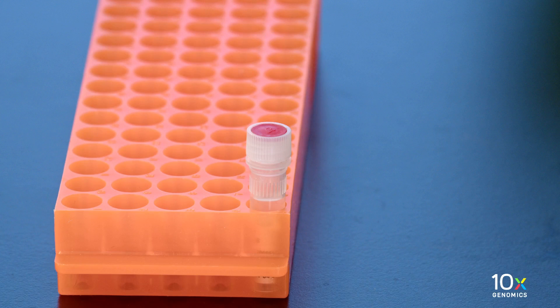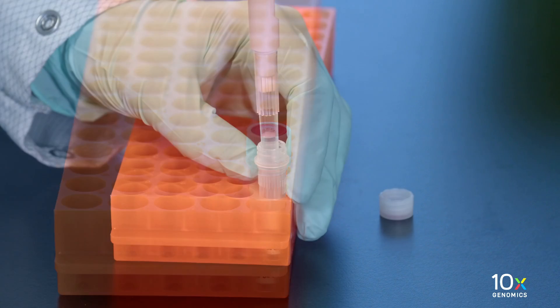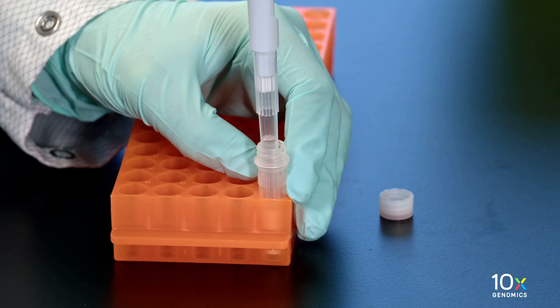Thaw the RNase buffer B at room temperature. Pipette mix slowly and thoroughly with a wide bore pipette tip. Do not vortex.